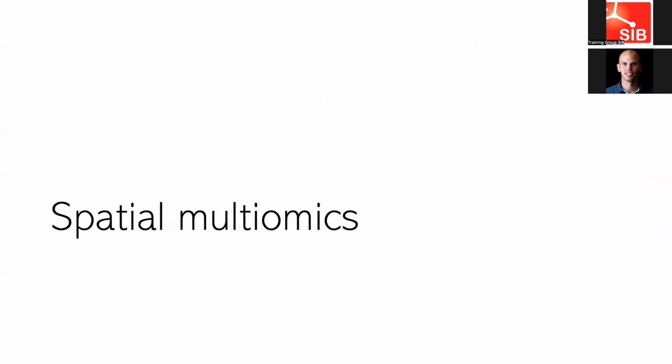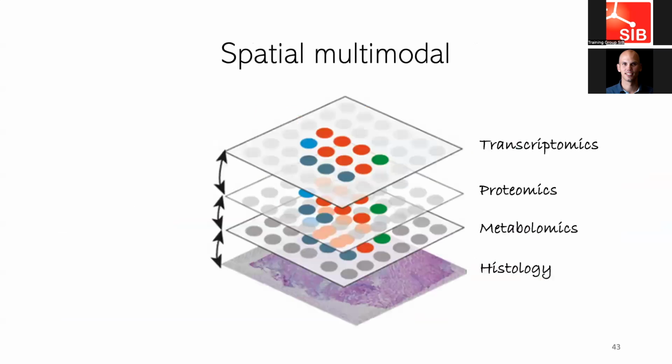Very few words about multi-omics. Of course, many people are interested in things beyond transcriptomics, right? You might want to measure proteomics or metabolomics or other omics features on the tissues that you're interested in. So there are sort of two ways to do this.